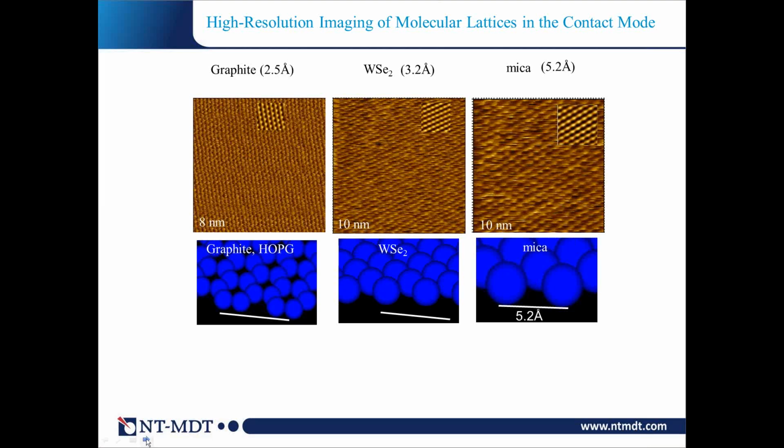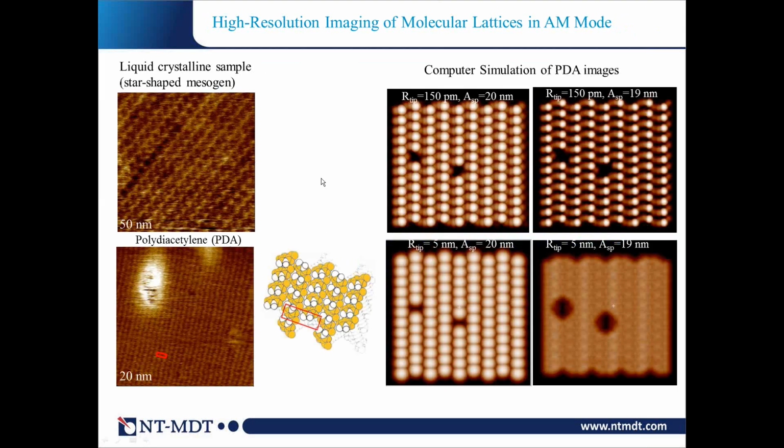The situation becomes difficult when you start to talk about molecular lattices and amplitude modulation. Up to now, there are only a few groups that have reached that resolution, imaging the lattices and also lattices with defects, which people believe is a demonstration of true atomic resolution.